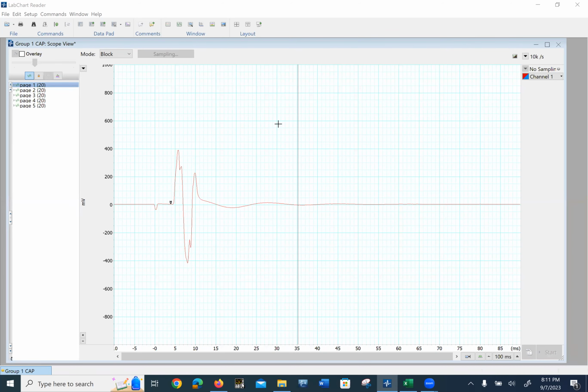Okay, this recording is how to get these files so you can get them on a graph. Some of you might understand how to work Excel. I don't. Remember that in the last video, we averaged the first 20 pages, the second 20, third 20, fourth 20, whatever it worked for your conditions of saline, lithium right away, lithium at 15, lithium at 30, for example, and washout. Maybe it was zinc. Okay, either way, it's the same thing.